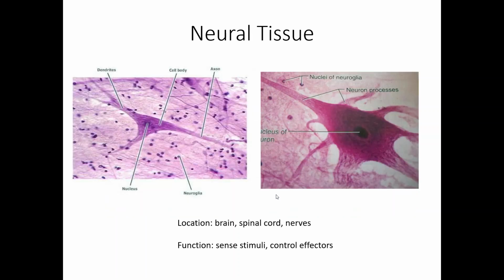We would like you to know that the neurons themselves, besides the fact that they're very large, usually have either more of a pyramid or more of a star shape. They're pretty easy to recognize. And then if you look at your lab list, you may be asked to identify the cell body, which is just the large portion of the neuron, the nucleus, and then we do want you to know the neuroglial cells themselves and things like that.